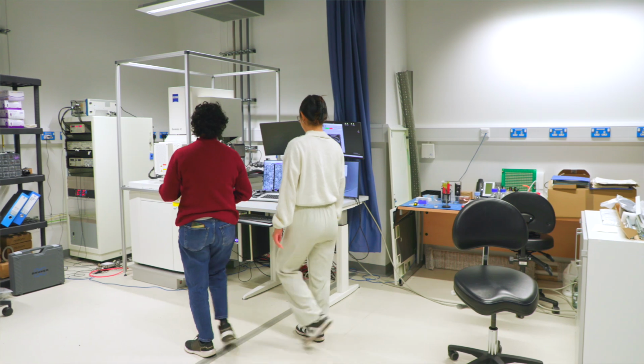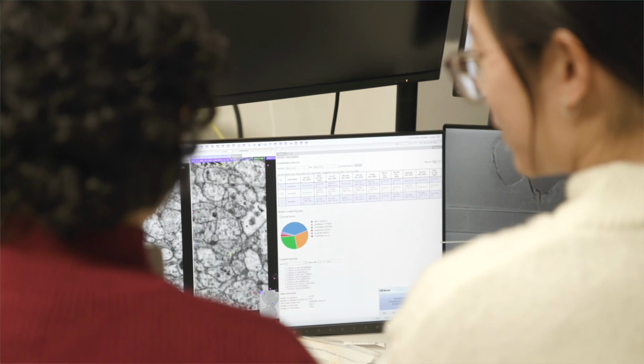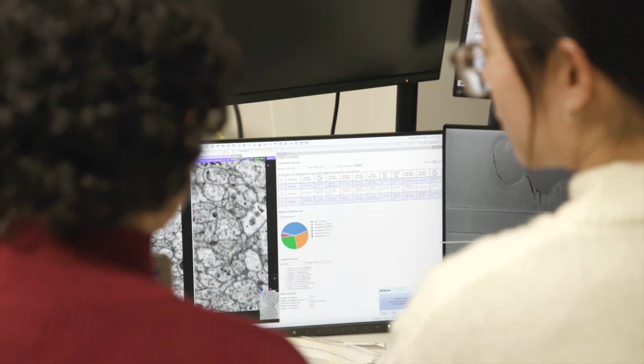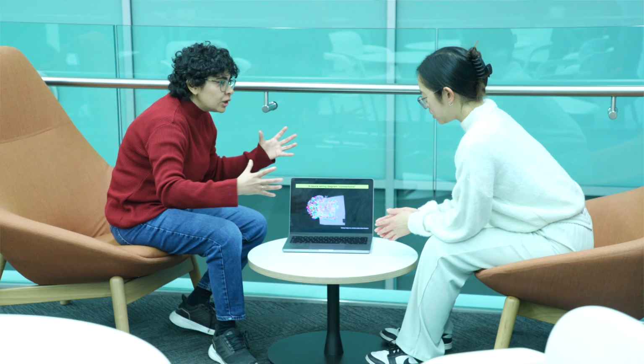So we have electron microscopes that take images of these brains, which come out as slices. We stack thousands of slices back up to, again, look like a 3D representation of the brain. What we are trying to do with computer vision is to teach these machines to identify objects in an image. For example, if you go to a zoo and take a picture, a computer vision algorithm can then identify different animals in it. We are trying to teach our machines to do the same thing, but just recognize neurons instead of animals so that we can reconstruct the connectomes faster.